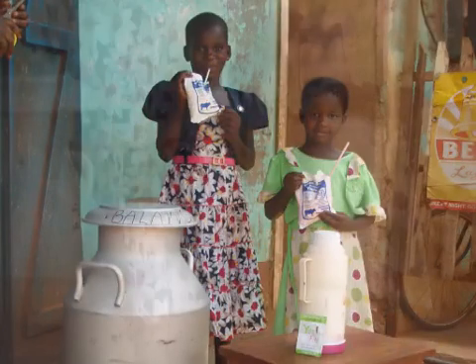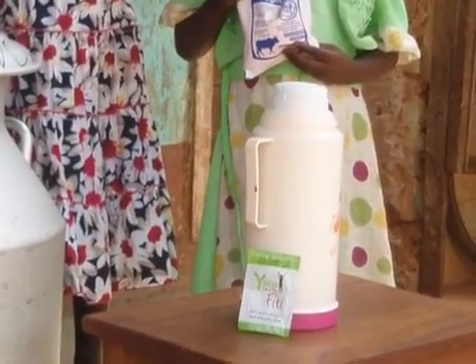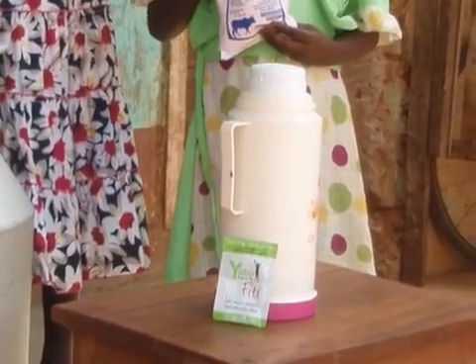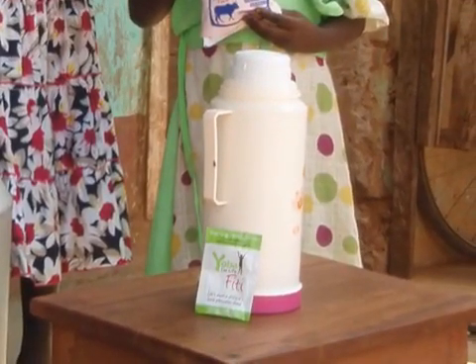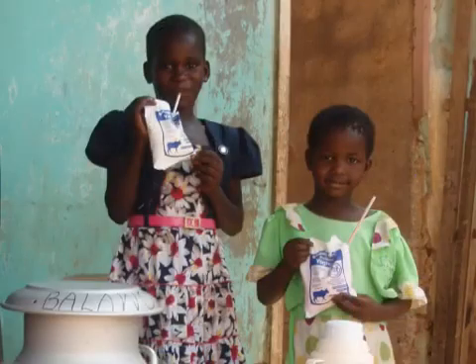In East Africa, one gram of a dried bacterial starter culture can be used to convert one liter of pasteurized milk, which has been cooled down to 45 degrees Celsius and transferred to a vacuum flask, into one liter of probiotic drinking yogurt. Afterwards, the yogurt can be used to start the production of 100 liters of probiotic yogurt in milk cans, which equals 400 plastic sachets of 250 milliliters drinking yogurt.